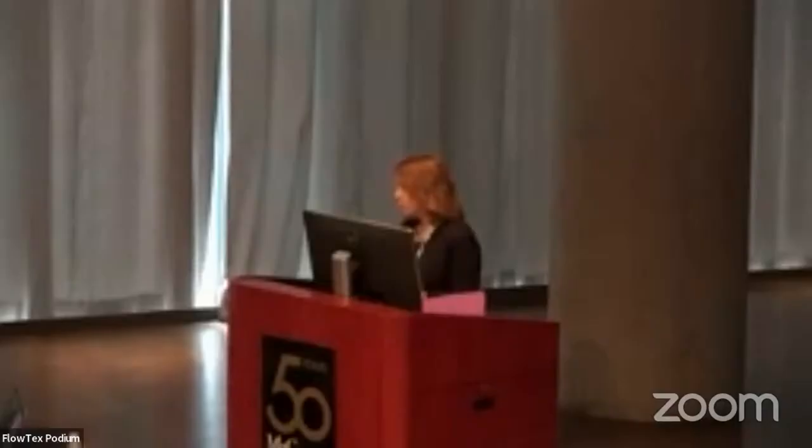You already emphasized how important the sample quality is, and that's just something that I see time and time again in my own core. I think one big difference between analysis and sorting is that you can gate the debris out in analysis or increase the threshold to eliminate it from your data file, but it will end up in your collection in sorting, or you have to really slow down the sorting speed if you have lots of debris. And that's one big difference between analysis and sorting.